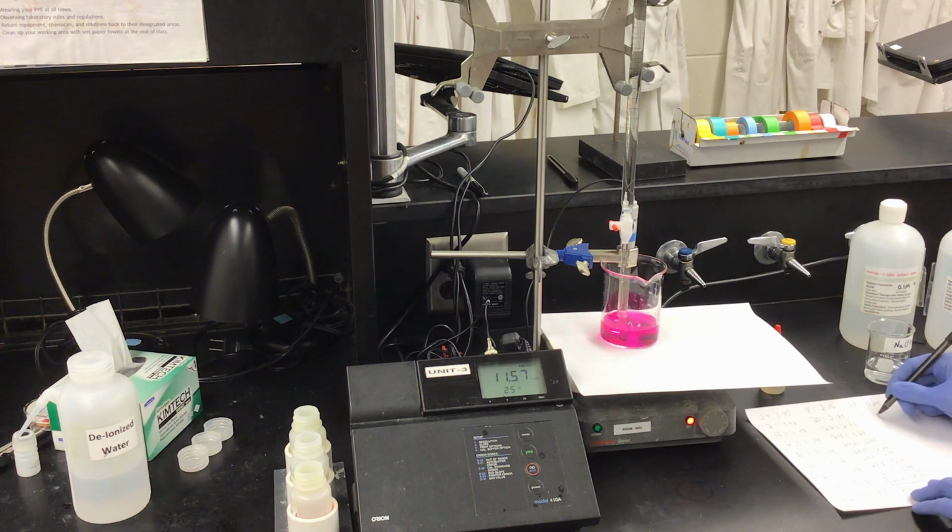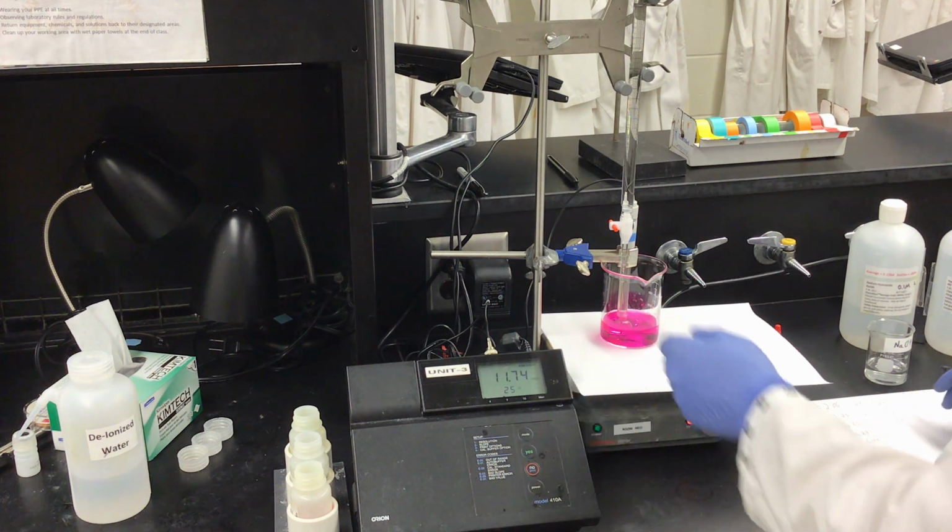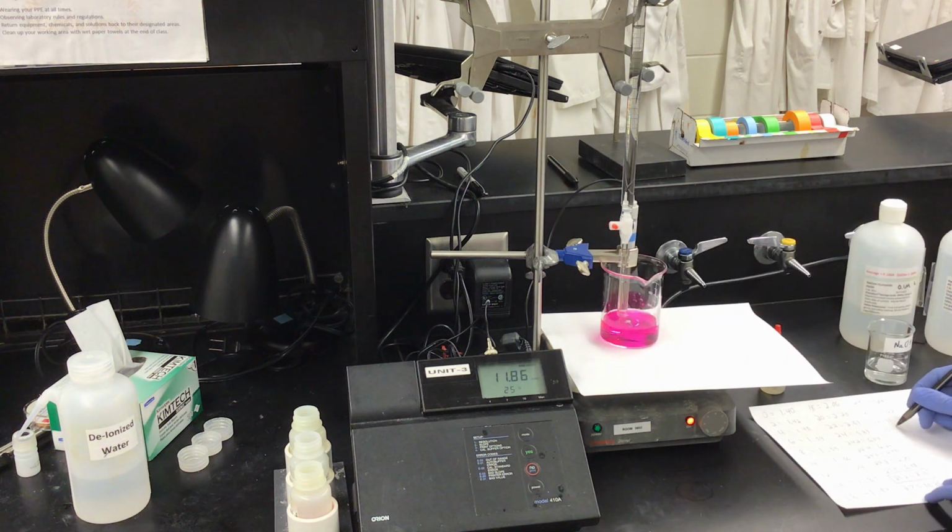Now at 31, we have a pH of 11.57. As you can see, we are slowing down in our increase in pH as we are becoming more basic. We are now past our neutral zone, and we are now making just a basic solution. At 33 mils, we have a pH of 11.74. At 35, we are at 11.86.